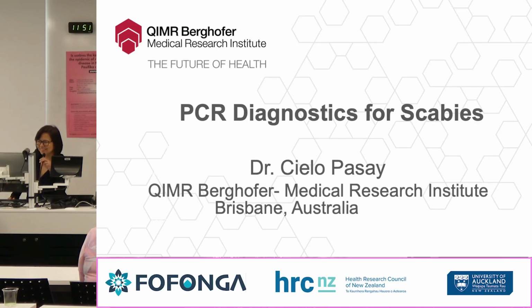Good day, everyone. It's way back in 2019 when I first came here in Auckland, and back then I'm just talking about a qPCR that I have optimized for scabies diagnosis. And this is after I met Dr. Simon in Darwin, because we also presented the optimization of scabies PCR.